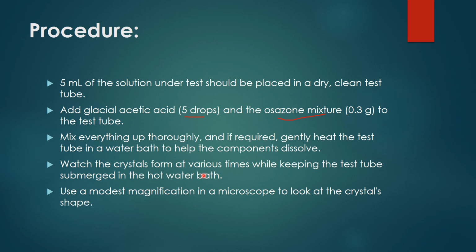So after heating the test tube in the water bath, watch the crystals form at various times and record the time while keeping the test tube submerged in the hot water bath. Use a modest magnification in a microscope to look at the crystal's shape.